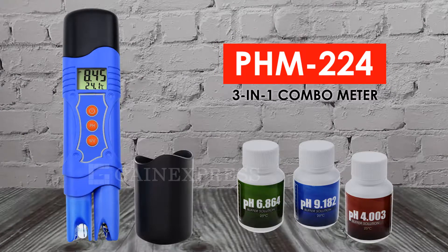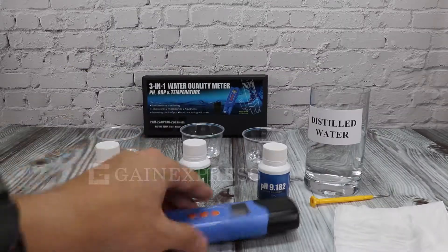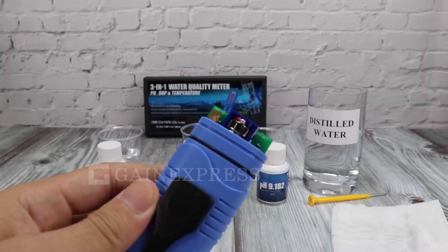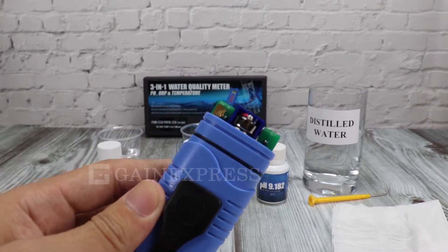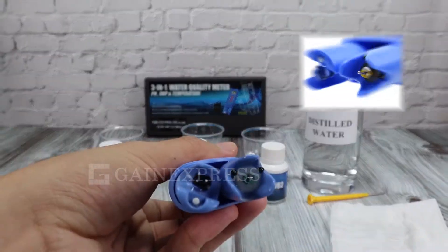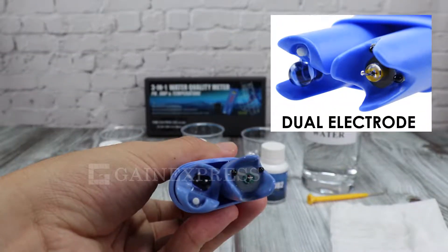PHM224 is a 3-in-1 combo meter that can measure pH, ORP, and temperature. It uses four button batteries to operate. Its dual electrode makes the measurement highly accurate.